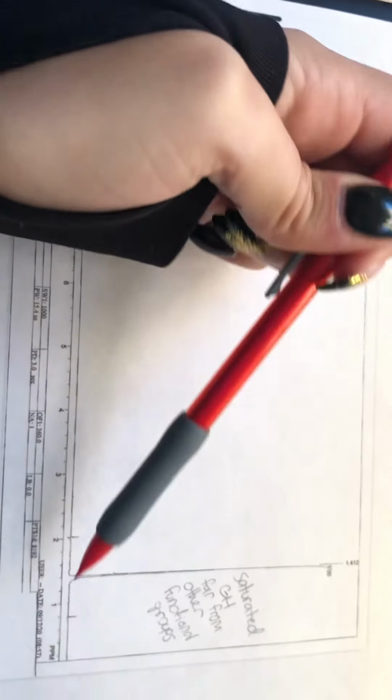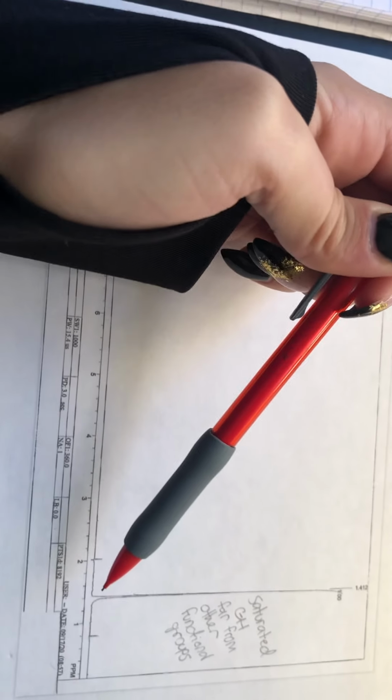So the purpose of this lab was to identify which of these elements is shown on this spectrum. As you can see, it's pretty clear there is only one type of hydrogen here because we only have one peak, and the spin-spin splitting shows that it is a singlet, and it is at 1.412. And like I said, there's only one type of hydrogen.